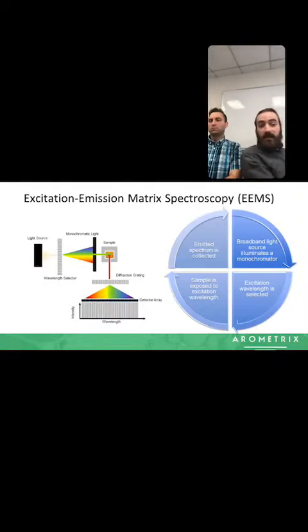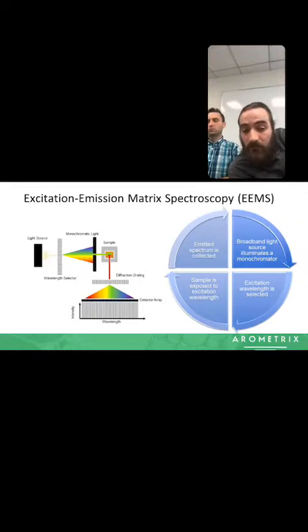So once we've actually selected what this light source is, or our excitation light, we illuminate the sample with that excitation light. That causes something called autofluorescence as well as absorption of the sample, and you can measure the spectrum of the autofluorescence or the absorption from the sample using a spectrometer. So I'm just going to show you a little bit about how this happens.